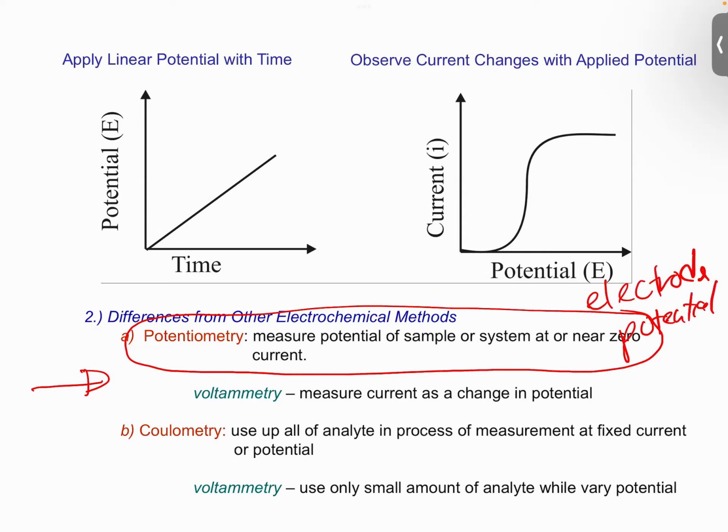Okay, so as I mentioned just now, with a pH meter, when you dip the electrode in the solution and get your pH reading, that is potentiometry. It's actually measuring the potential difference between the solution and the electrode of the pH meter. So that's how you get the reading of pH. But for biosensors and chemical sensors, we usually use voltammetry.